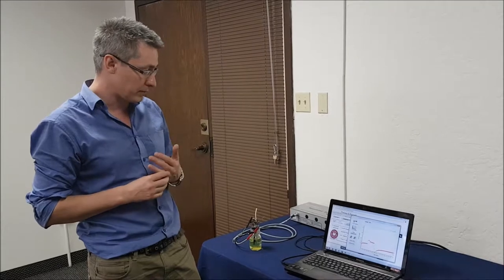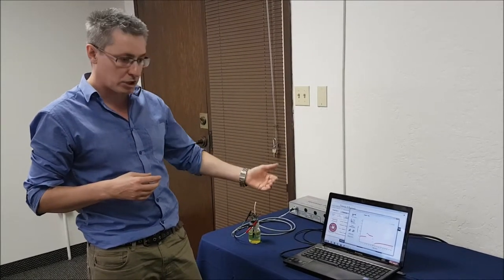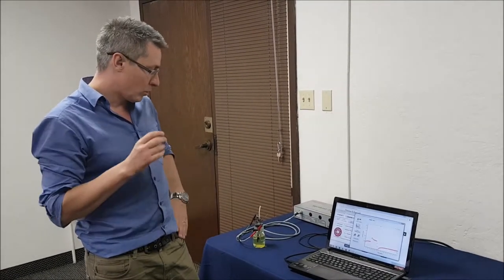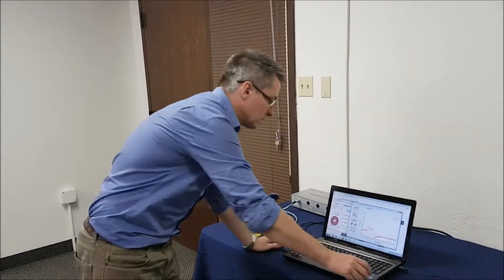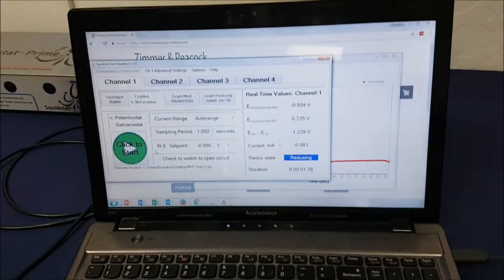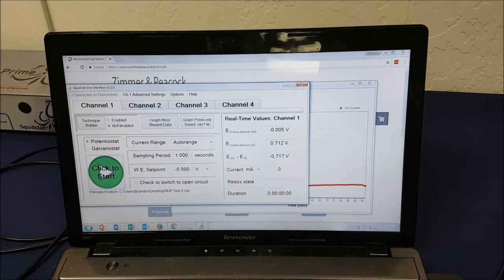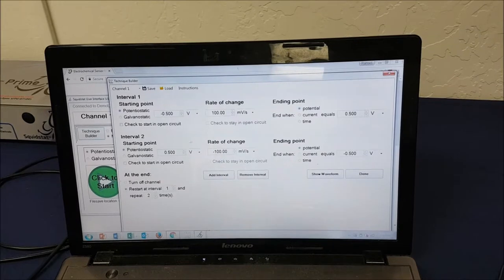I really love this live changing of parameters and seeing the experiment change. When you're trying to fish around to find out what the right parameters are, this is a nice little feature. So now we have talked about the quick start. I want to talk about writing experiments. Now, I am an expert because I learned this about 10 minutes ago. So what I want to do is go to what's called the technique builder.